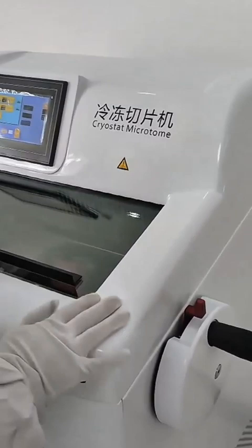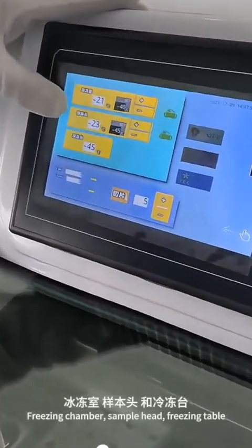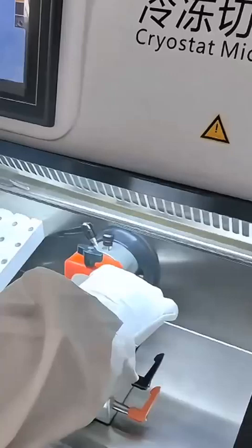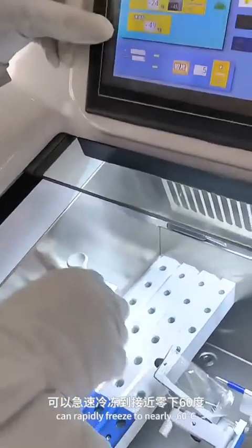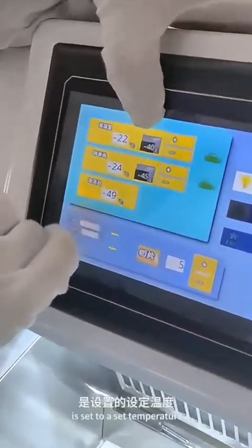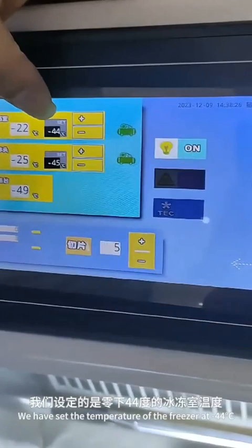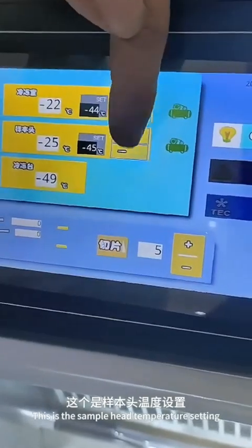Now let's take a look at the main display area: the freezing chamber, sample head, and freezing table. It corresponds to chamber temperature, sample head temperature, and freezing table temperature. The freezing table temperature can rapidly freeze to nearly minus 60 degrees Celsius. This place is set to a set temperature — we have set the freezer temperature to minus 44 degrees Celsius. This is the sample head temperature setting.